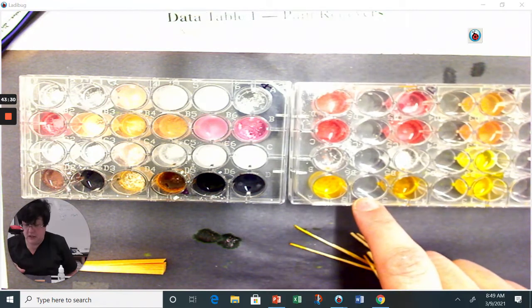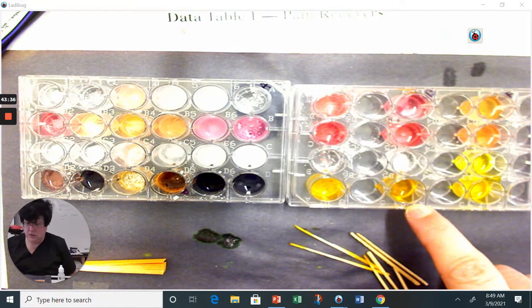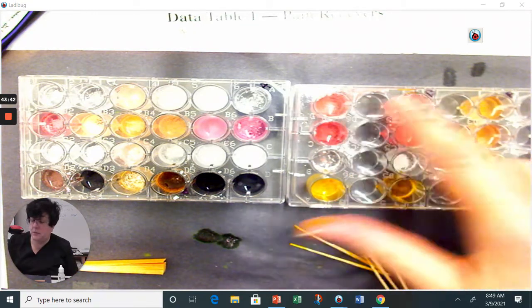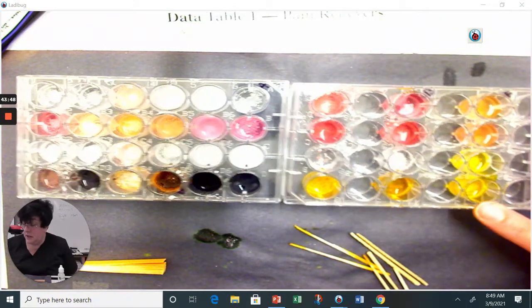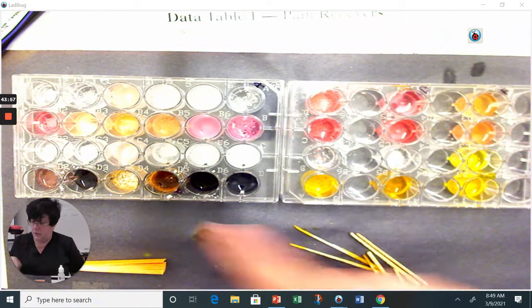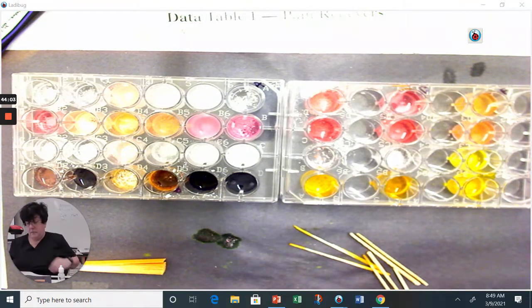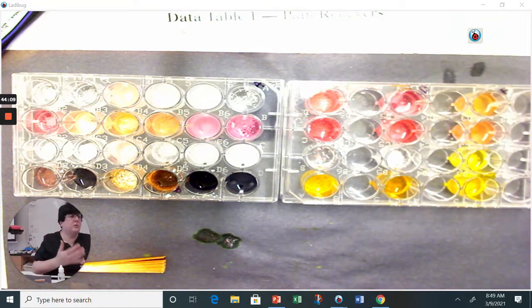This is unknown C. Okay, this is unknown D. And this doesn't look the same because remember I double tested the pH. So you're looking at these 3 wells. And then unknown F. Unknown F is not matching up very well at all. I really expected unknown F to look more like Bufferin because of how it bubbled. But the bottom isn't turning brown like the Bufferin did. But choose the one that works best for you, one of those 4. You can pause and really look at the material. So you're going to finish filling out that data table.